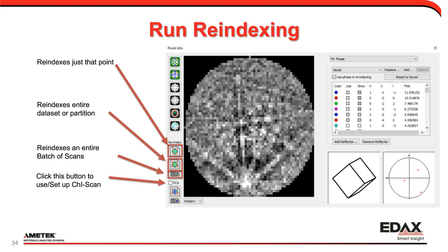So you click on the button, a further group under settings pops up, and you run through it doing a full run of scans. Again, this is highly useful if you're doing 3D work. I have 50 EBSD scans, I missed a phase, I go ahead and click this button. Underneath that is what we call the PCA. It's basically our chi-scan. It stands for phase cluster analysis or principal component analysis, depending on which language you want to use. And essentially it just uses chemistry.